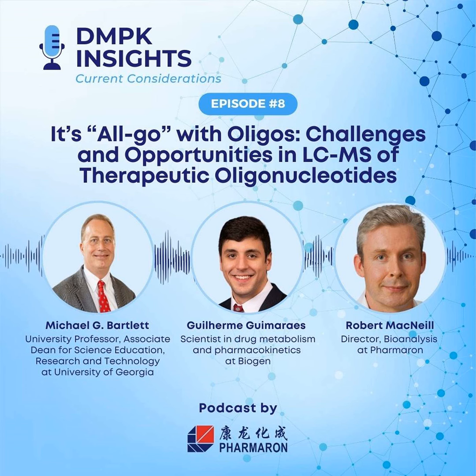Well, I think if you were to look at the origins of chromatographic analysis of oligos, it really all started with reverse phase separations using ammonium acetate. So I don't think it's really surprising that since this was such a popular mobile phase for LC-MS due to its volatility, that people decided to use it to look at oligos as well. There was also not a surprising move then to start with ion pairing using triethylammonium acetate as well, because that had been used pretty successfully with peptides as well. And so I think it was a pretty logical move early on to go to that.